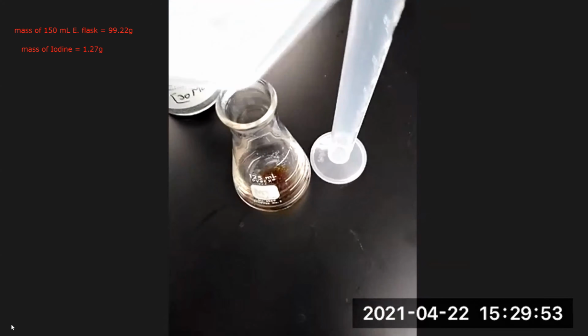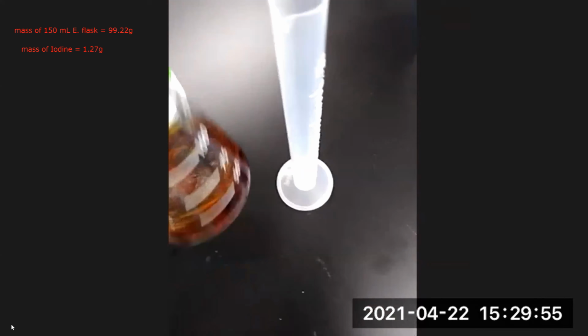I'm going to pour the iodine into the methanol and mix it up. And make sure all the iodine has dissolved before you add the zinc to it.